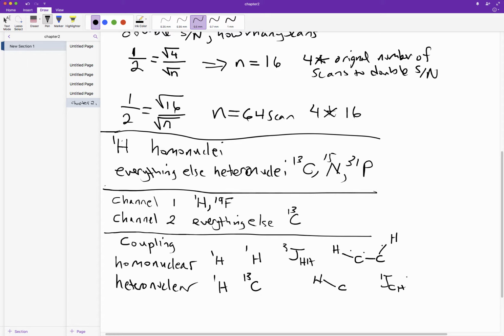You would measure these with something like an HSQC experiment, which we'll talk about later, or HMQC. These all give you basically the same information.